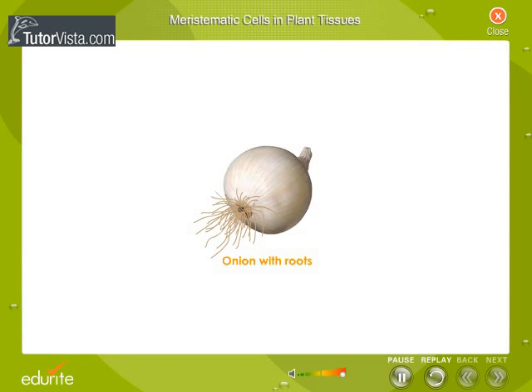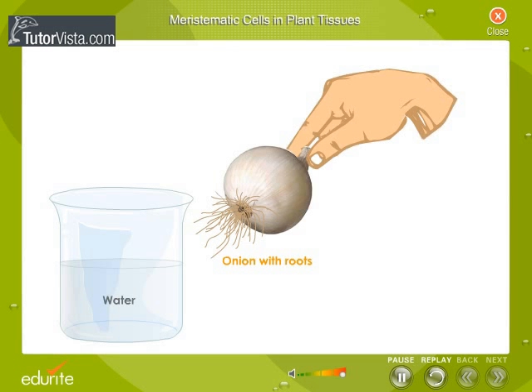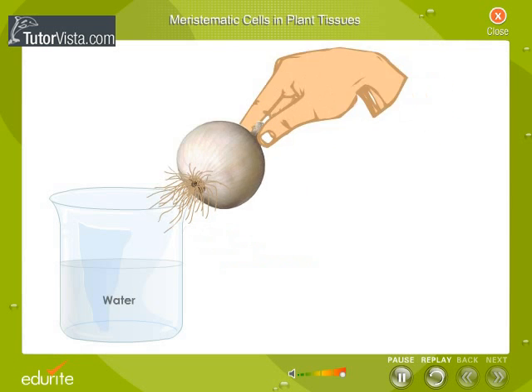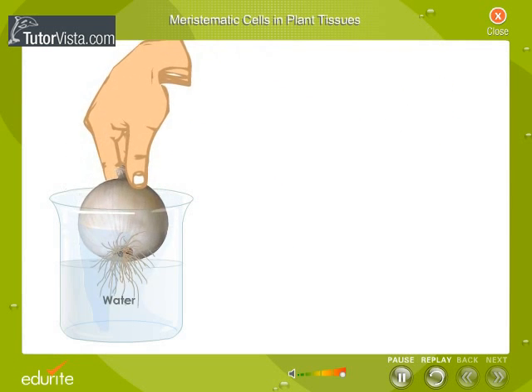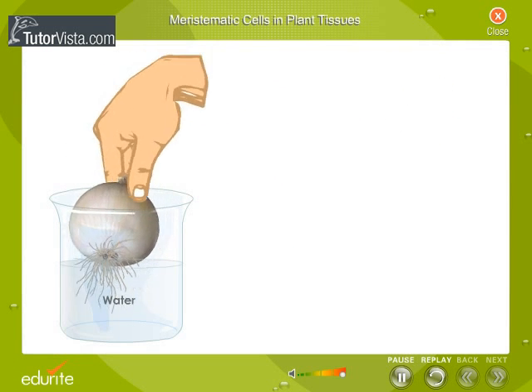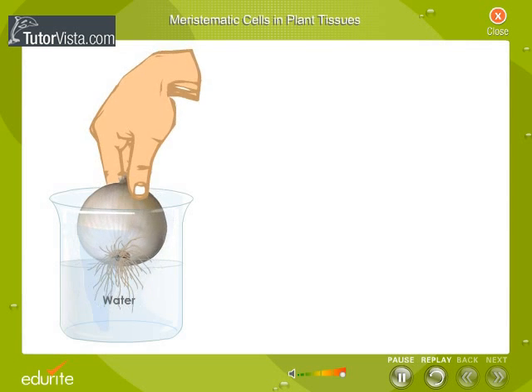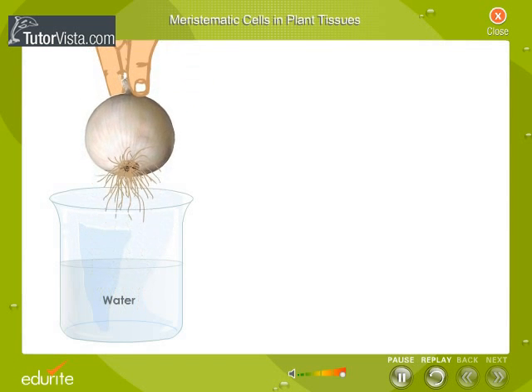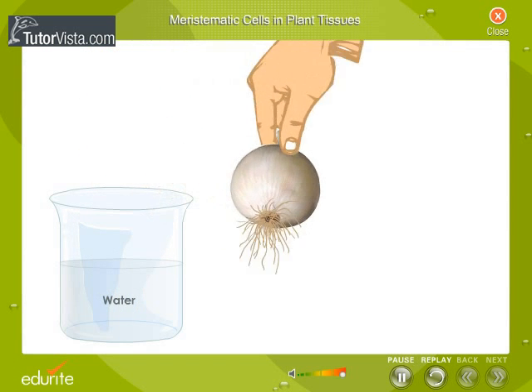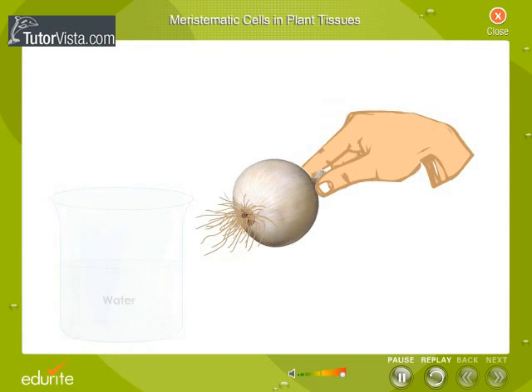Take a fresh onion along with its roots. Wash the roots with water and cut a longitudinal section of the root tip.